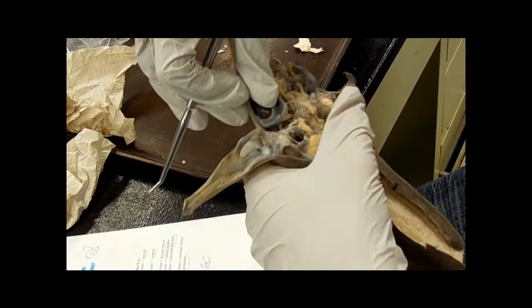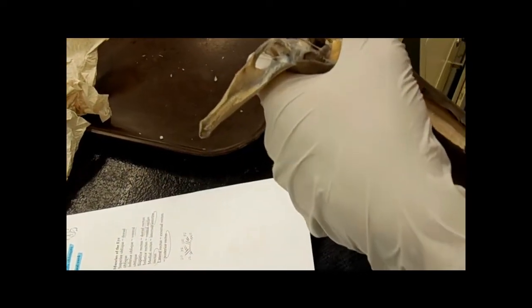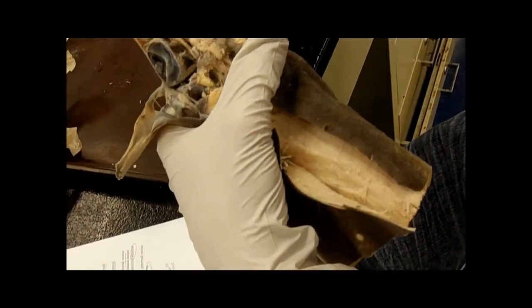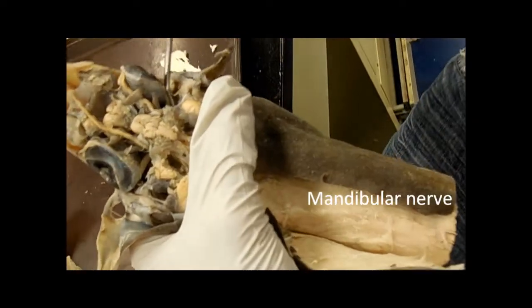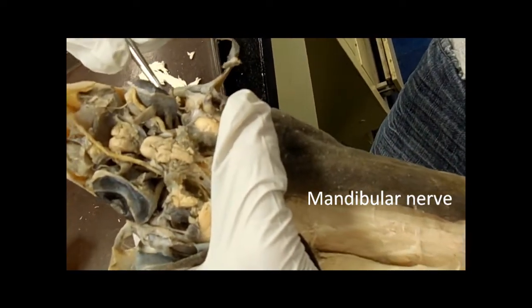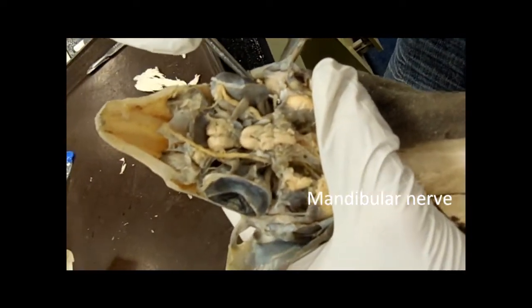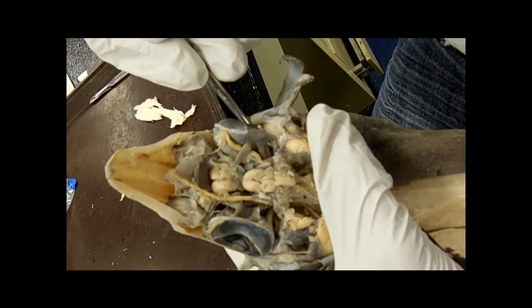Back here, it's closer to the eye. What you have is, I think it's easier to see on this side, is this nerve right here, right behind the eye. This is the mandibular. Don't get it confused with maxillary. This is mandibular.